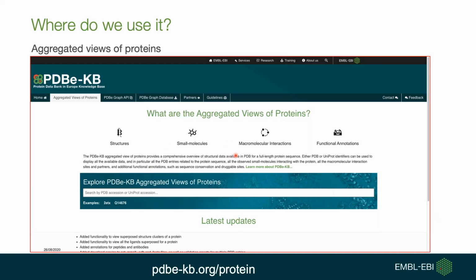This is the home page of the aggregated views of proteins. You can use this link to access this home page. Aggregated views of proteins gives an overview of all the structural data that is available for a protein of interest. You can search for a PDB entry ID or a UniProt accession.